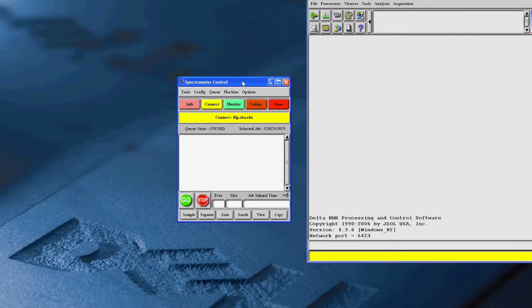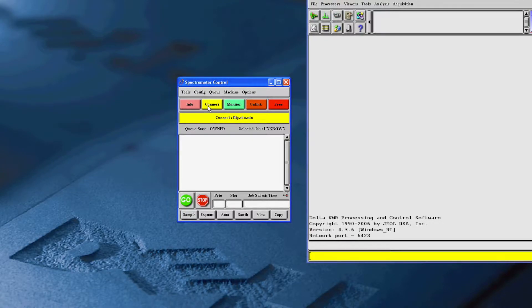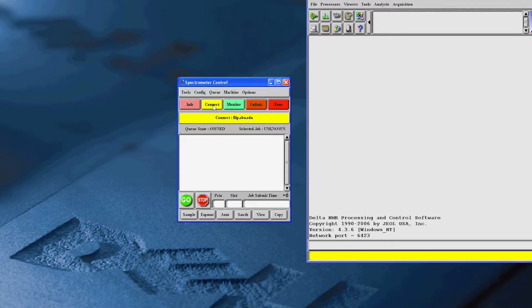Make sure that the device is connected by hitting the yellow Connect button. You should see the yellow bar saying Connected.